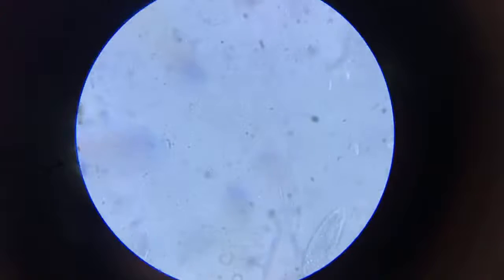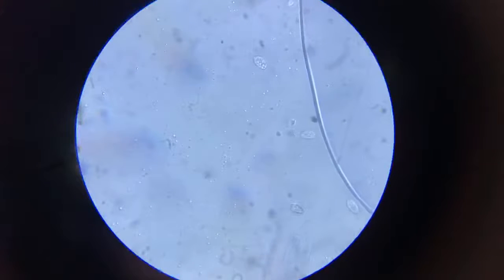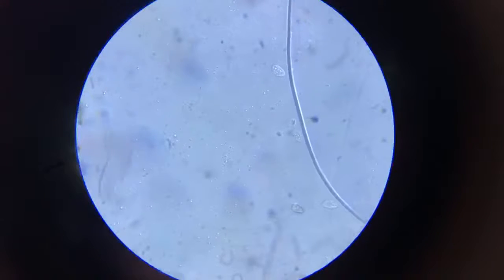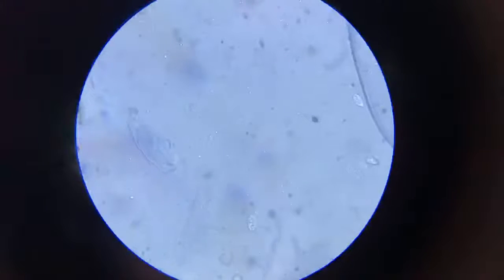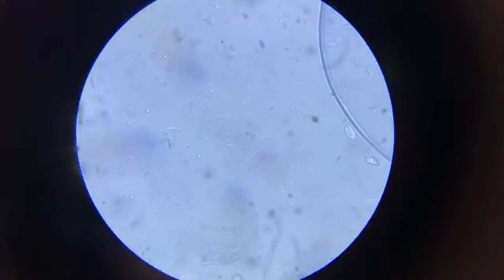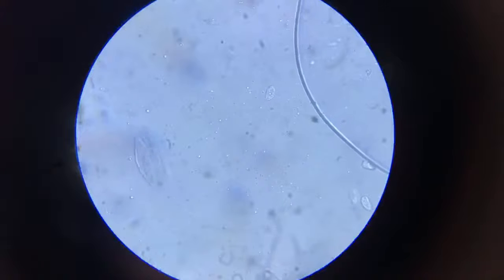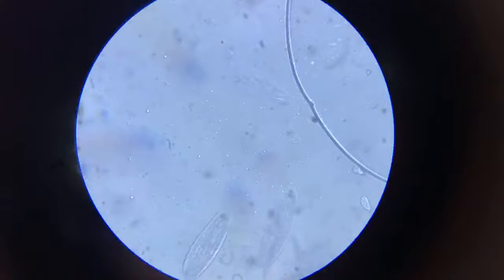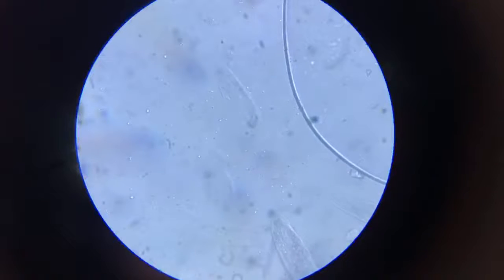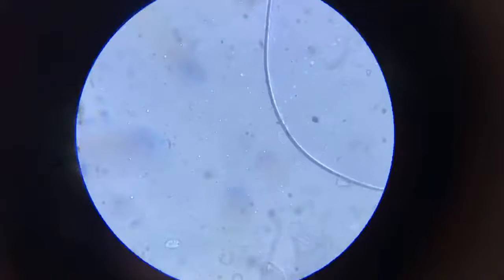They'll keep running from one end to the other till they reach a space where they cannot have any more water left for themselves. These little euglenids, they are also under the same stress. They also have to rush. There you see the water film is closing slowly and slowly. It won't be much long when they have no space left with any water, and without water, they won't survive. They'll burst.